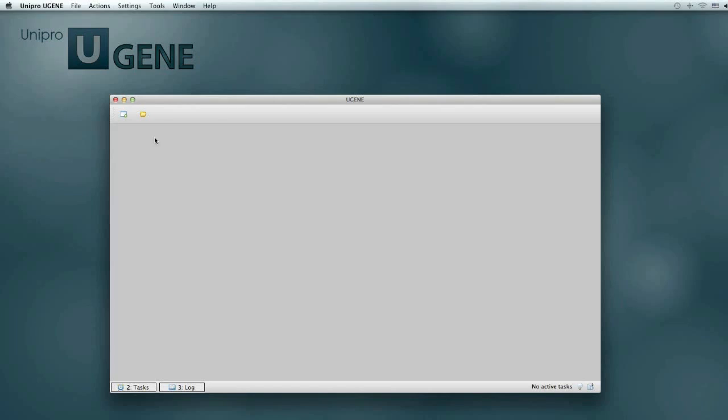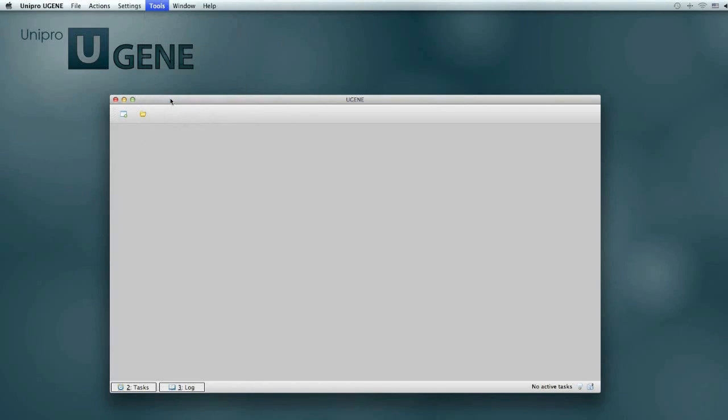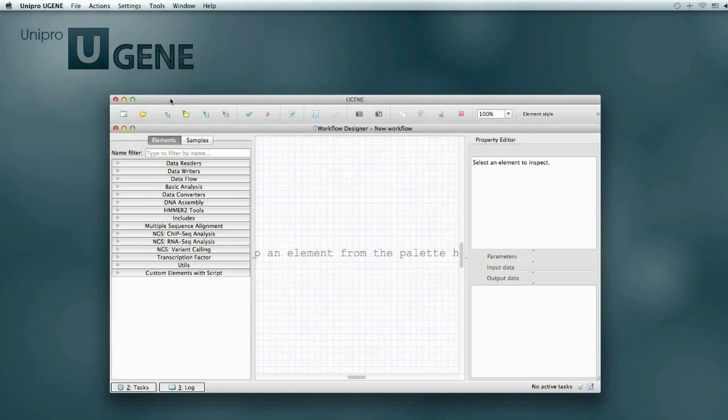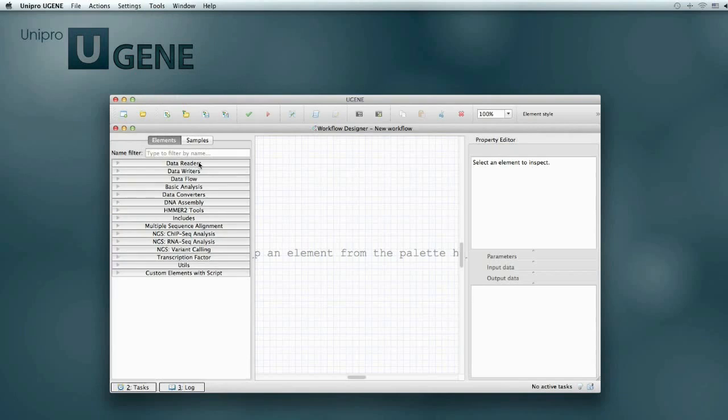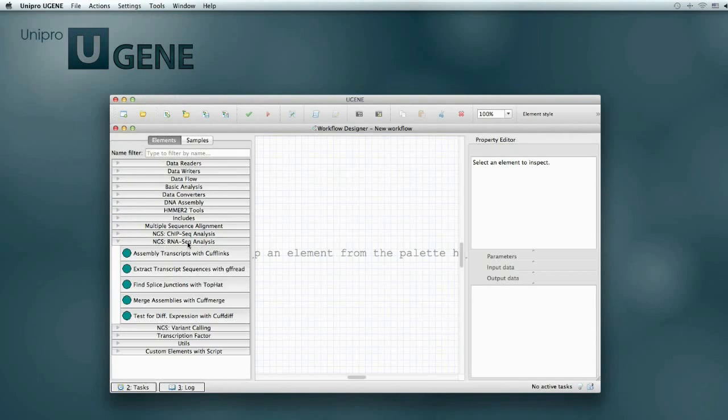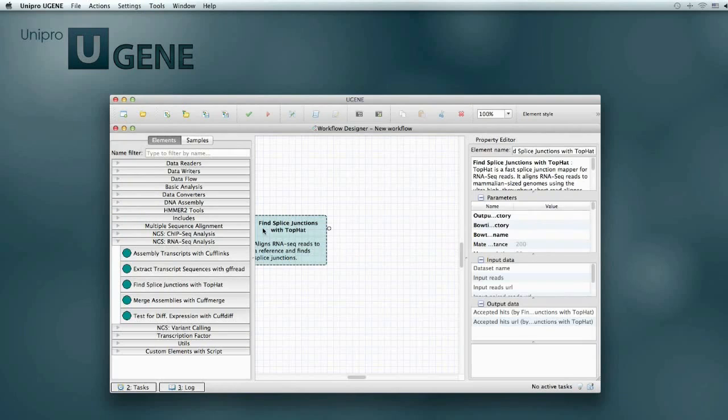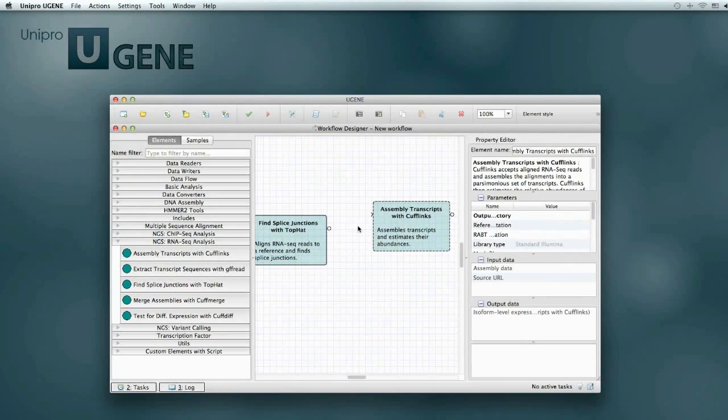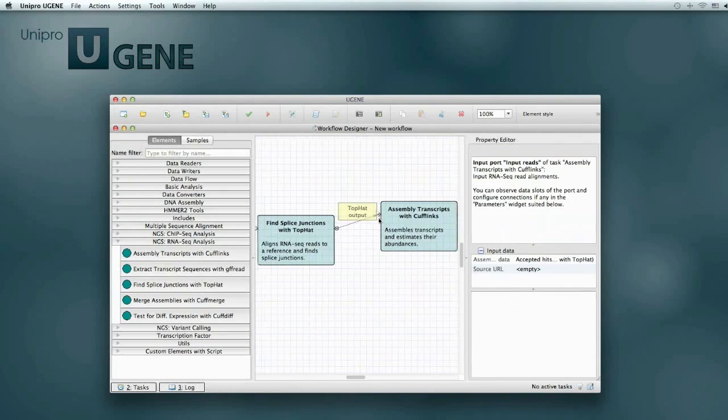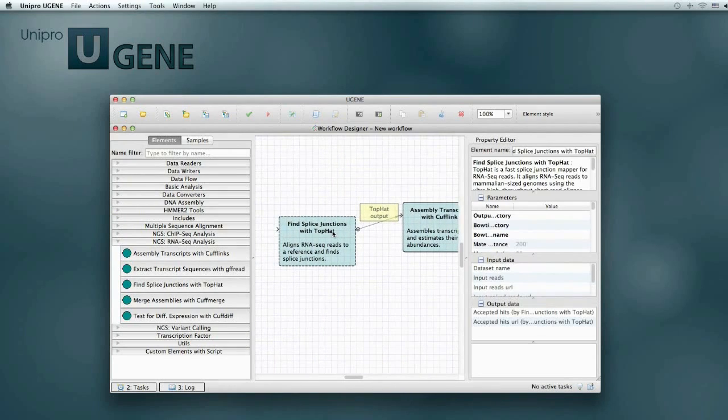All the pipelines can be used in the UGENE workflow designer, the graphical system for construction of computational workflows. If you have a multi-stage computational task, then you can use the workflow designer and easily create a workflow that will solve the task. Once created, the workflow can be used multiple times for performing calculations on different input data.